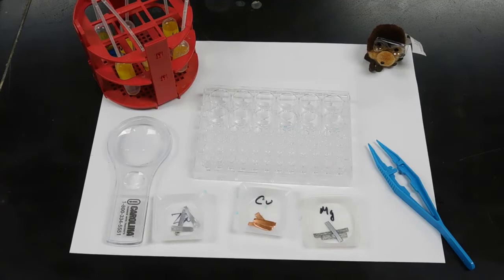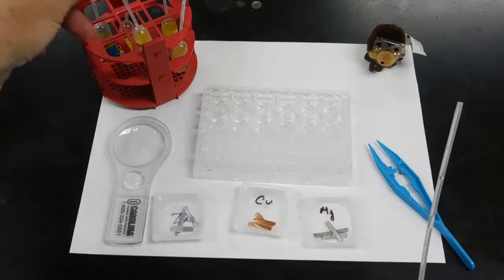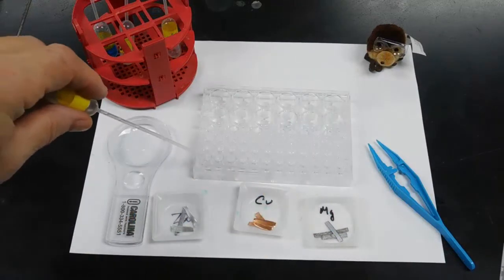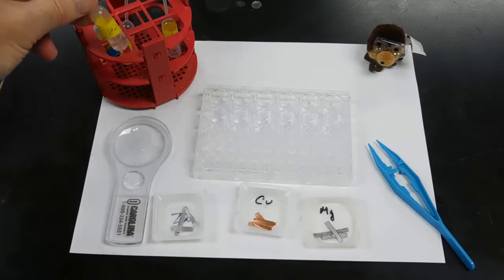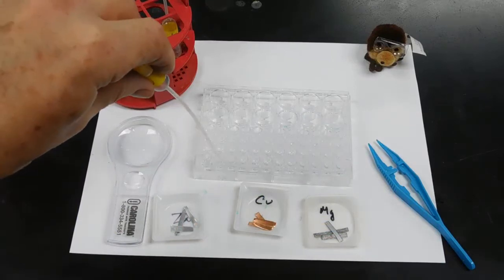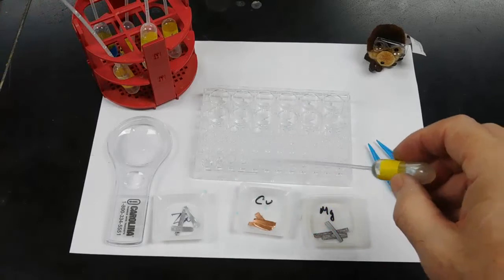In developing the activity series, I'm going to place some solutions of zinc 2 nitrate in one of the small well holes, lead 2 nitrate in the second one, and aluminum nitrate in the third. So in my first well hole, I placed approximately 10 drops of the zinc 2 nitrate. In the second, I have lead 2 nitrate, and in the third, I'm going to put my aluminum nitrate.